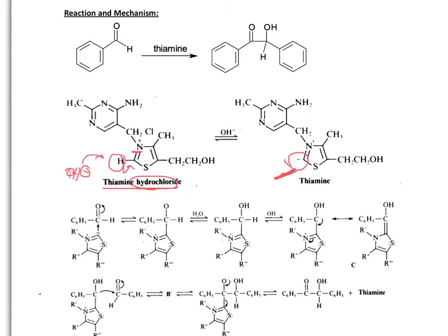At that point, you're going to add benzaldehyde, 4 milliliters of that, and your active species, which is the nucleophile right here, is going to attack, causing the negative charge to go on top of oxygen. That's going to exchange a proton to give you the alcohol, and in the presence of the base, you're going to remove the most acidic proton, which is going to generate a negative charge.